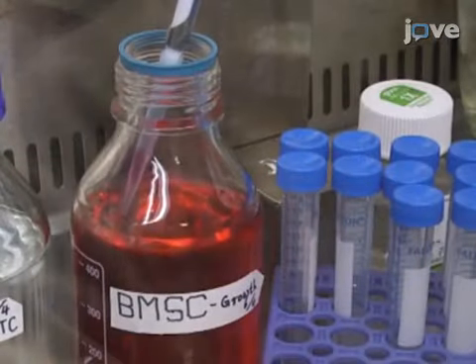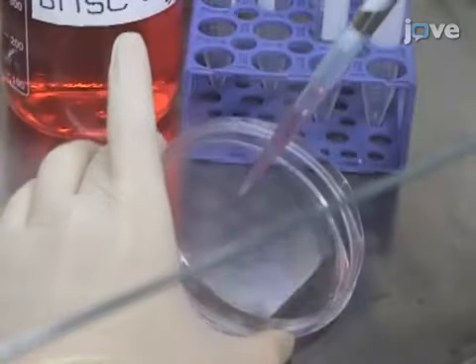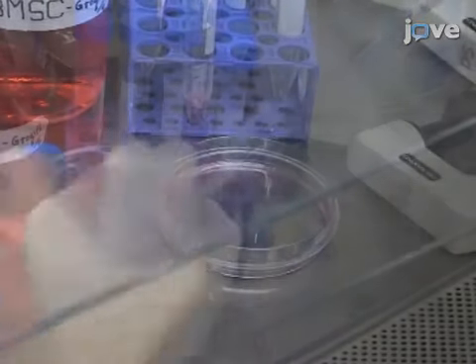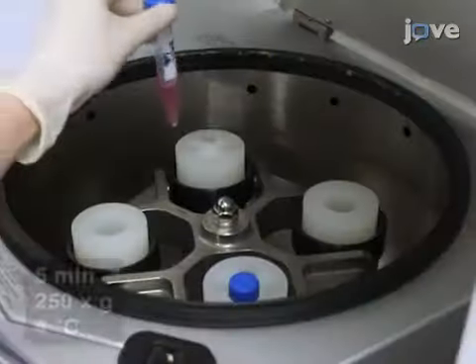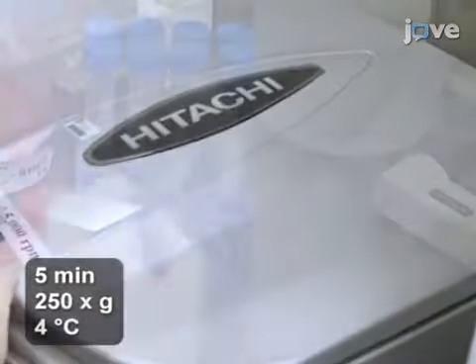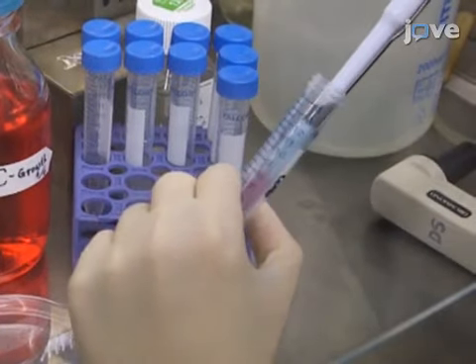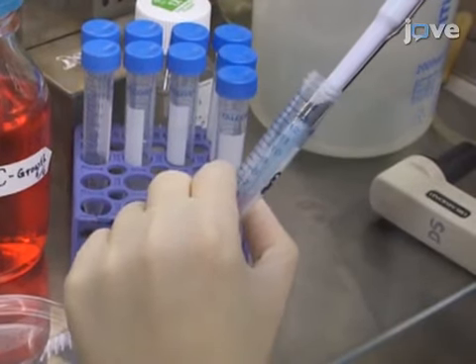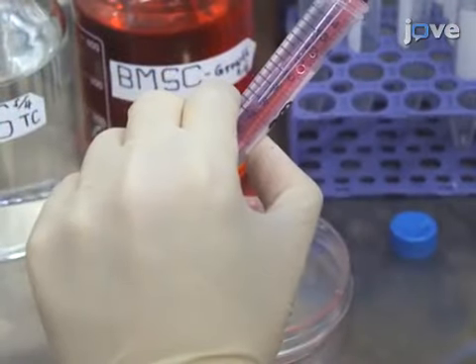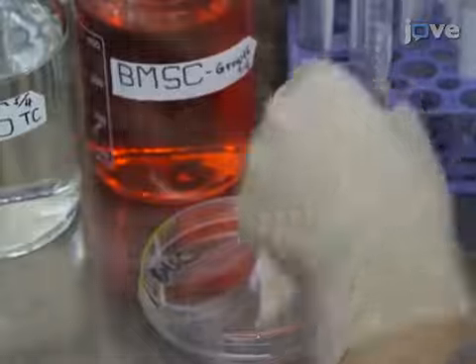After 5 minutes at 37 degrees Celsius, add 3 mL of MSC growth medium to neutralize the reaction and collect the detached cells by centrifugation. Resuspend the pellet in 5 mL of fresh MSC growth medium and seed the cells at a 4 x 10⁴ cells per square centimeter density in a new vessel.